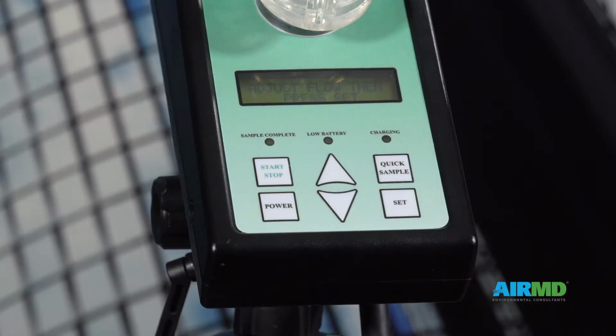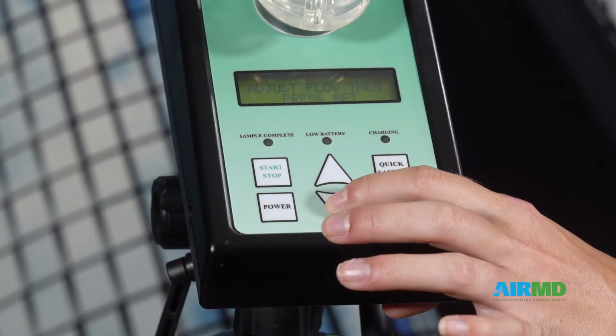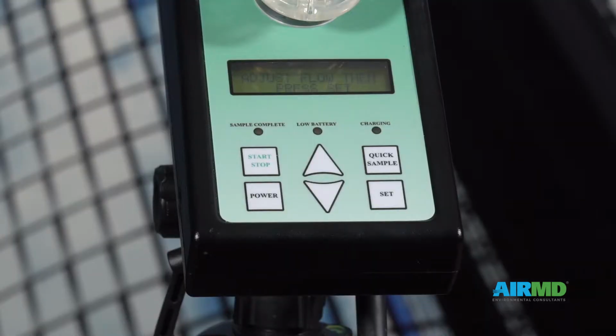Adjust the pump's airflow by pressing the up or down tabs on the pump. The pump is calibrated once the middle of the flow ball in the rotometer is at the demarcation line. Once the desired flow rate is achieved, press the Set button on the pump.